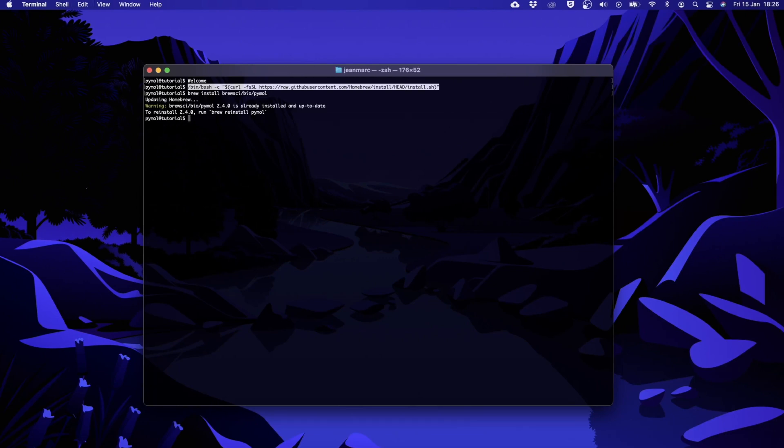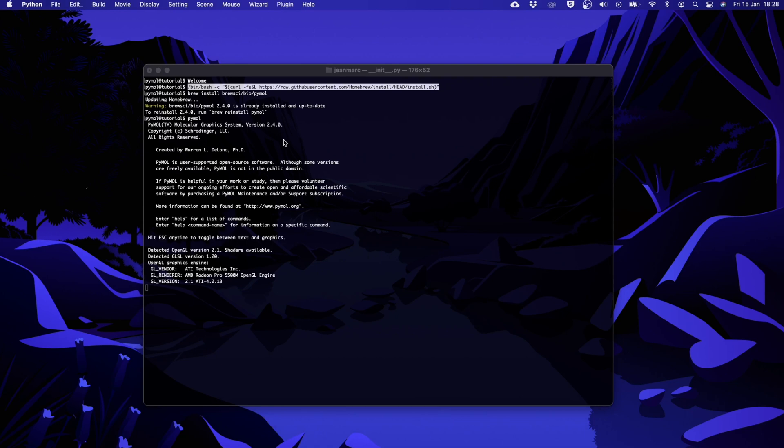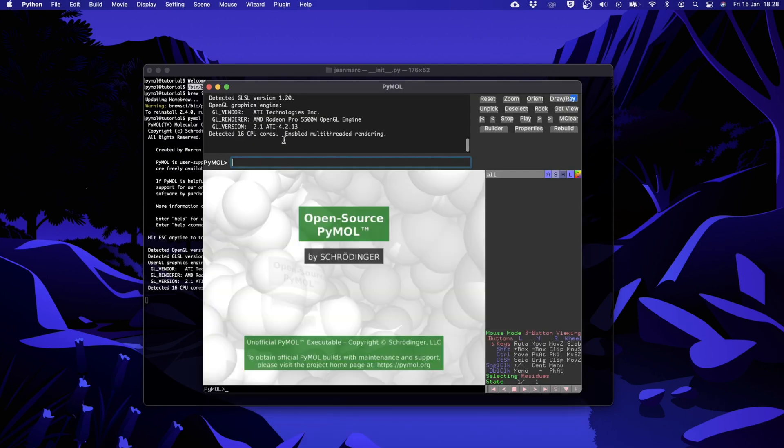Here on my Mac it says that it's already installed which is normal because I had it from before. The next thing we want to do is to start PyMOL simply by writing PyMOL into the terminal and if everything went well the software should start.